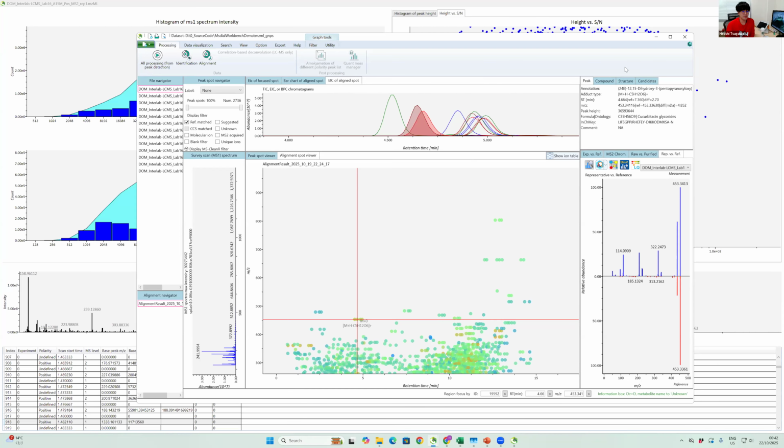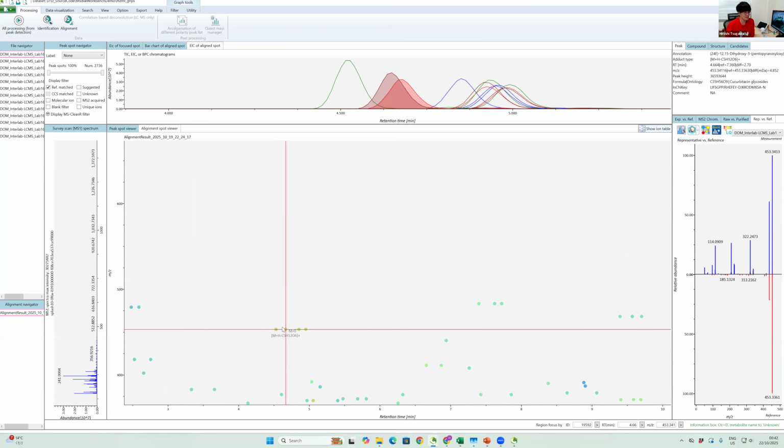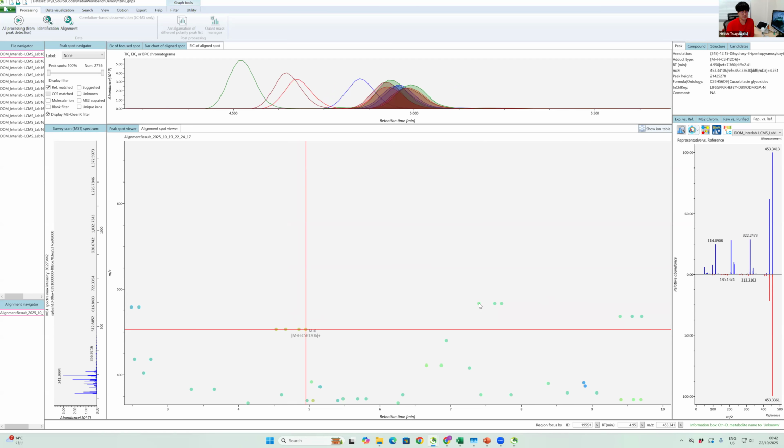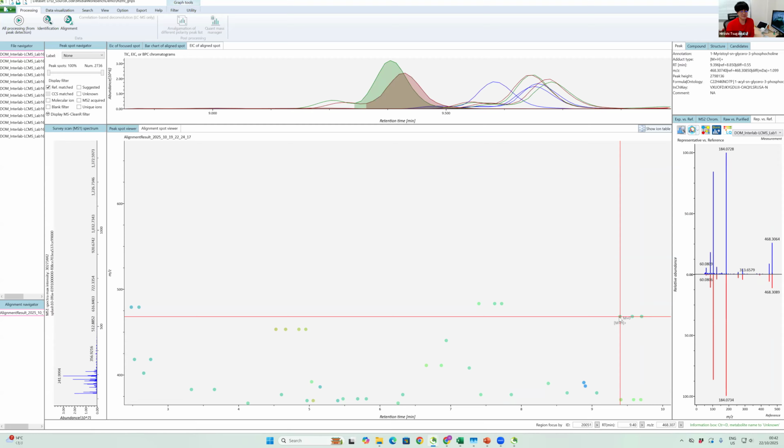For example, you can see multiple spots having similar tandem mass spectrum patterns in many retention time regions, something like this. You see here? So it simply means the reproducibility of chromatography is a bit lower than what I expected.